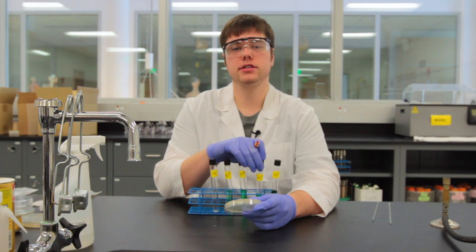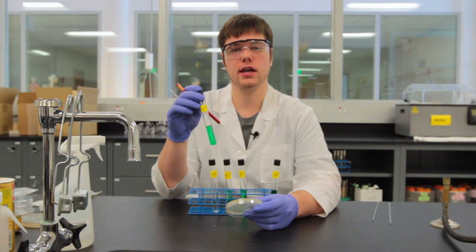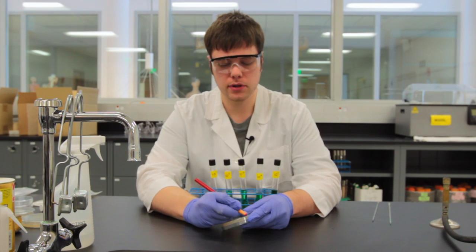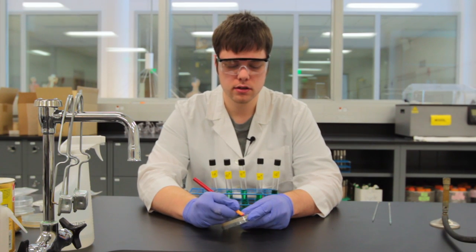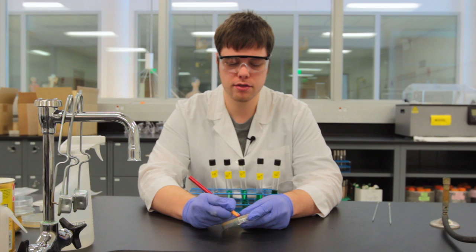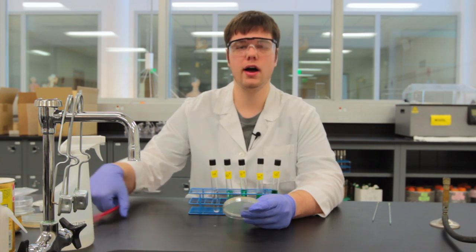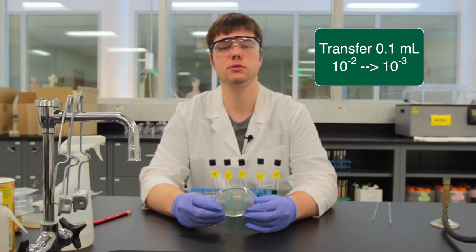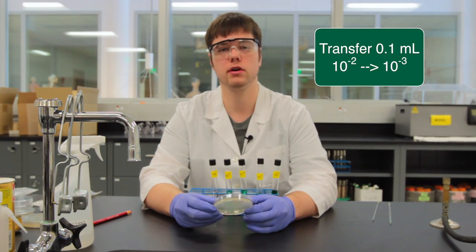My lab manual tells me that I need to use the 10 to the negative 2 dilution for this experiment, so I'm going to label my plate as 10 to the negative 3. The reason why I'm labeling it as 10 to the negative 3 is because I'm only going to be dispensing 0.1 mils onto this plate.